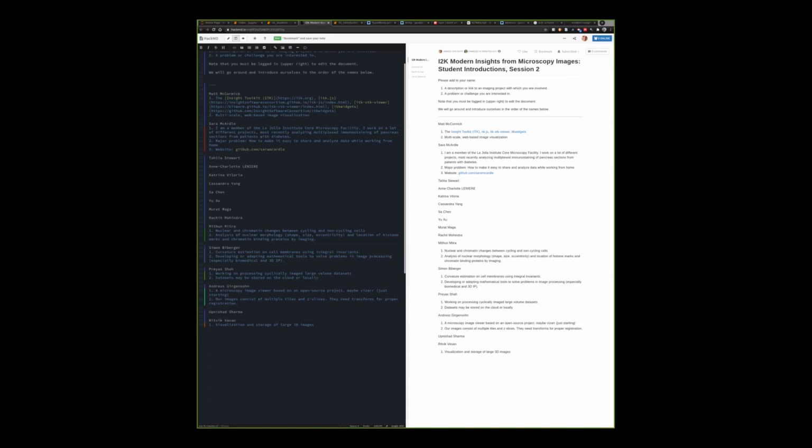Fantastic. And what kind of modalities of images have you been working with? It's bright field and fluorescence microscopy images across 25 different structures. Great. Cool. Are they brain images? No, these are human-induced pluripotent stem cell images. So the single cell level, also FOV level. Great.